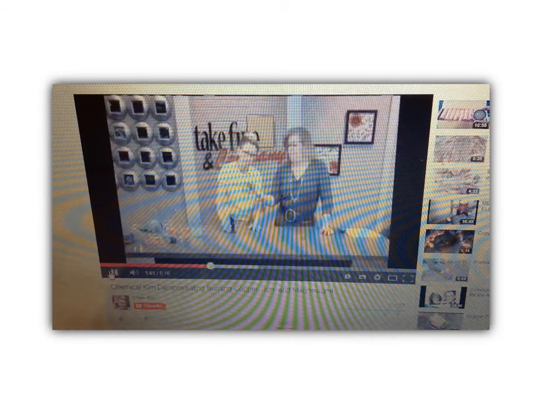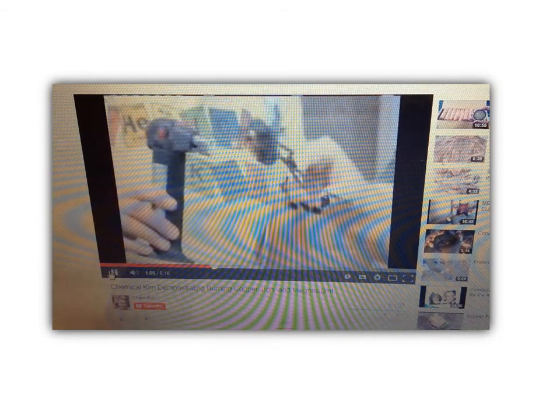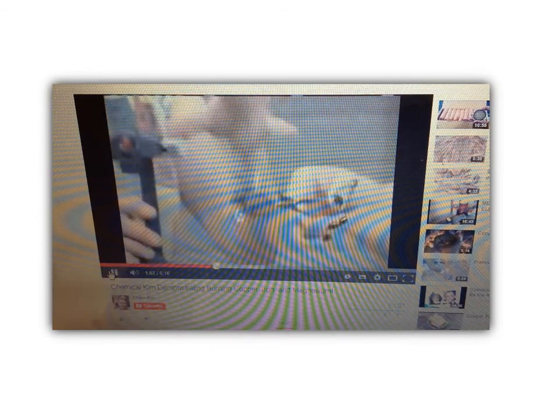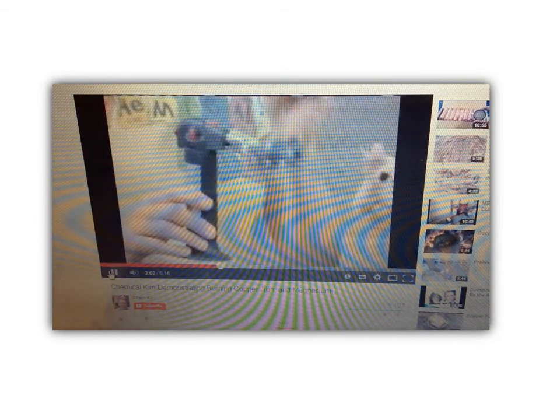Over here we're going to put iron, and we're going to burn that. We're just burning it in air. Again, we're going to land up with a bit of an orange glow. And again, this time we form iron oxide, which really is rust. So it's going to be a bit reddish brown in color.